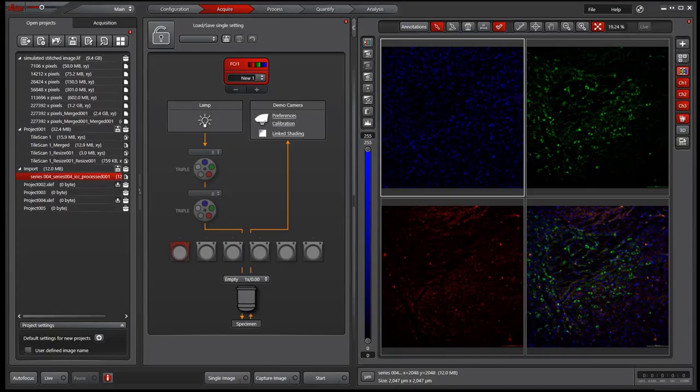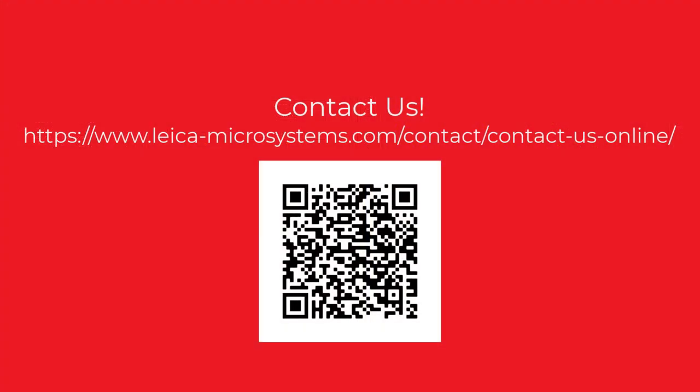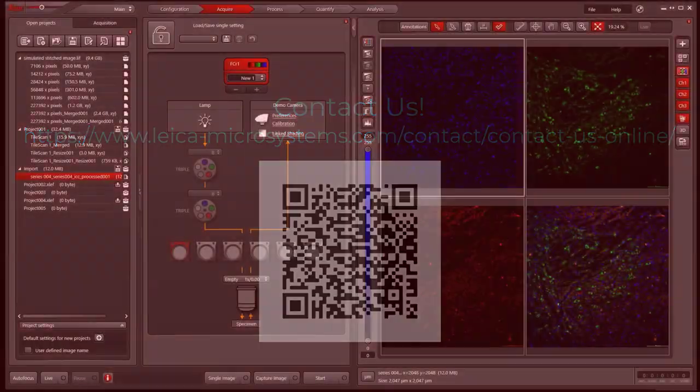So now you should know how to handle large image size in LSX software now. If you have any questions, please contact a local advanced workflow specialist or fill out the form at leica-microsystems.com. Thank you.